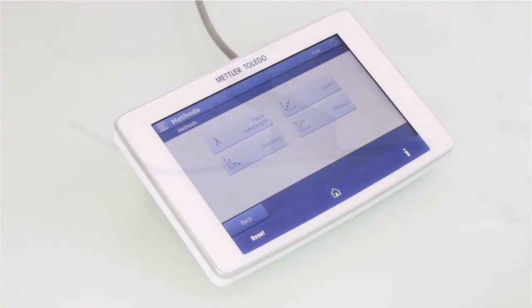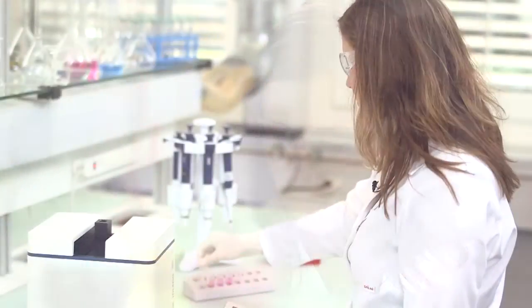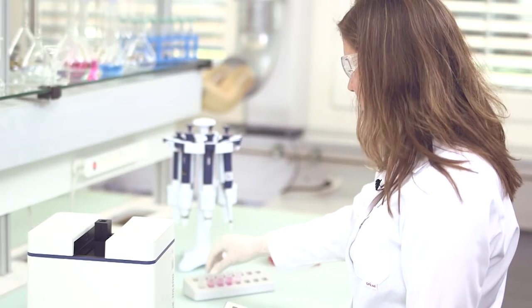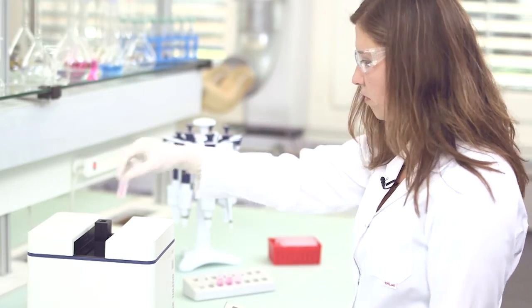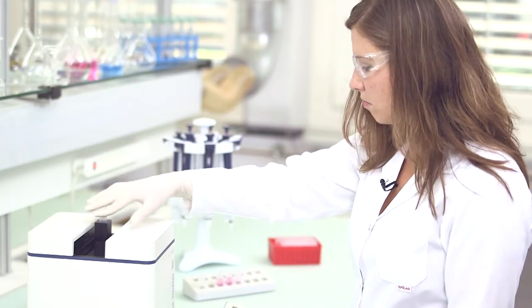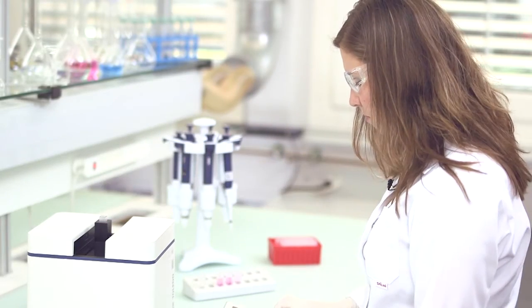Mettler Toledo predefined application methods include instructions for sample preparation, all necessary calculations for the result evaluation, and automatic report generation to help you with your daily workload.